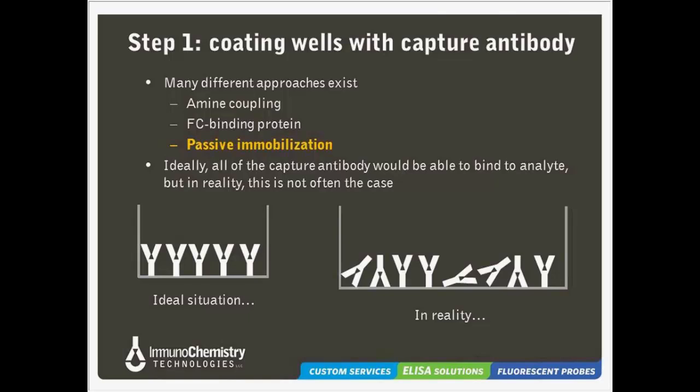The high pH was used to make sure that your antibody has a charge. Now, the isoelectric points of most antibodies is in the 6.8 to, some as high as 9, but most of them are in that neutral to mid-7 range. So when you adjust the buffer to a pH 9.6, all the proteins in there, the antibodies or antigens, are going to be in the negative charge form.